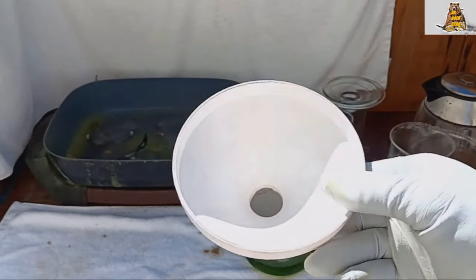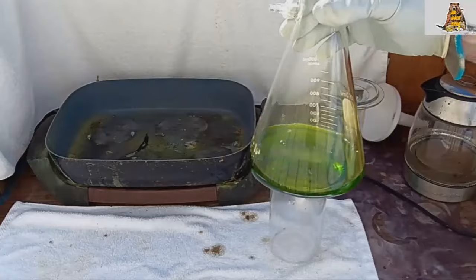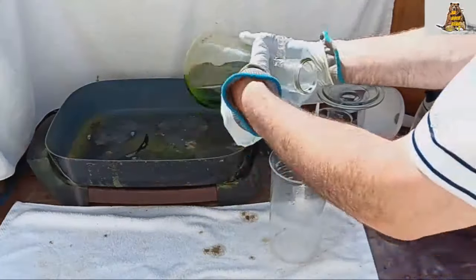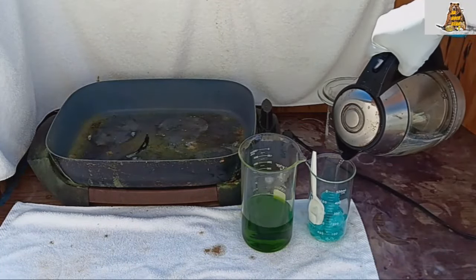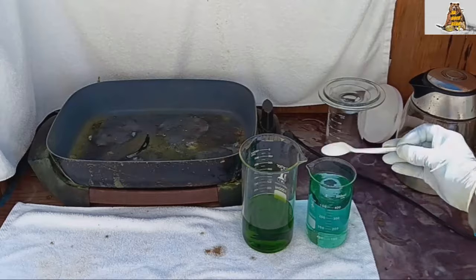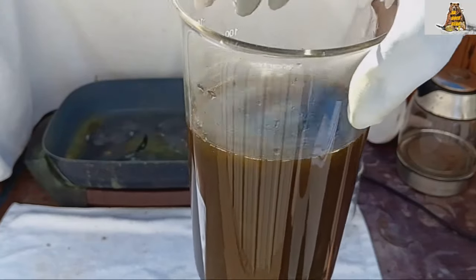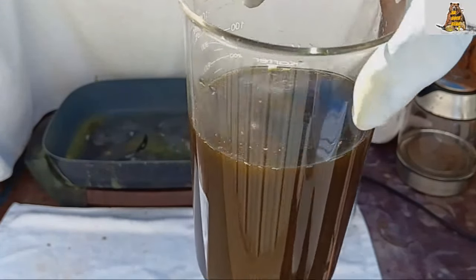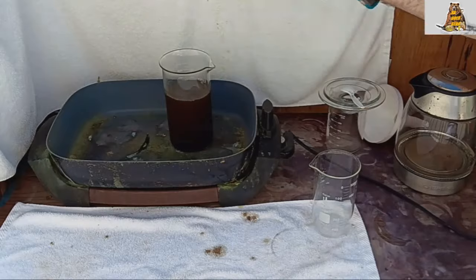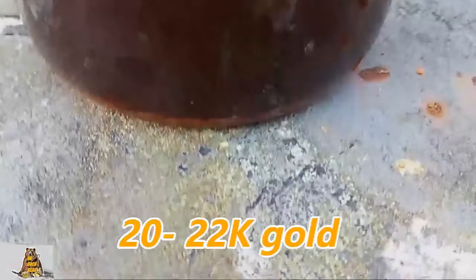There will be a lot of dirt on the filter — many chlorides — and that's good. The solution is green because it still has a lot of copper: gold and copper together. I will precipitate the gold again with ferrous sulfate.